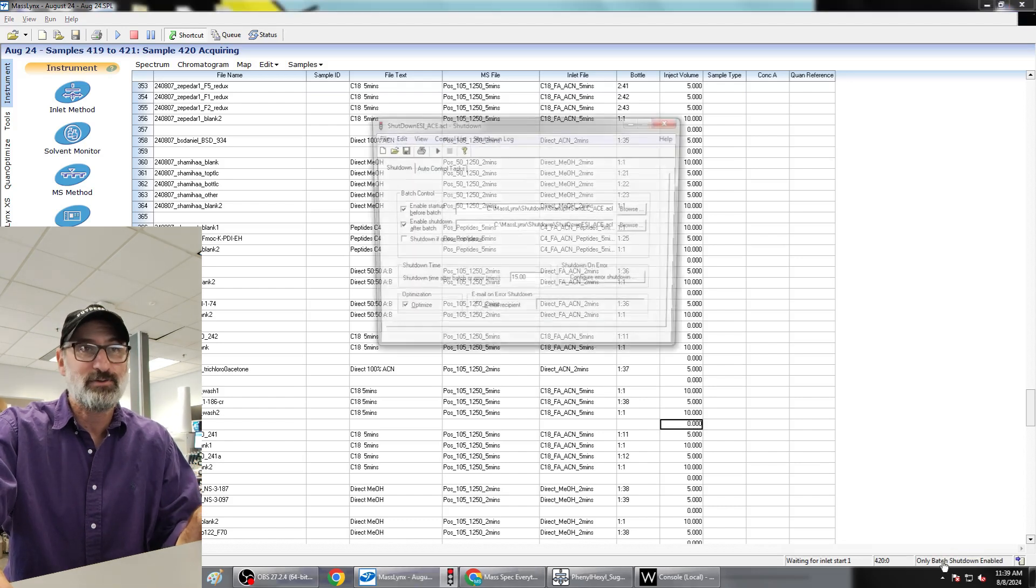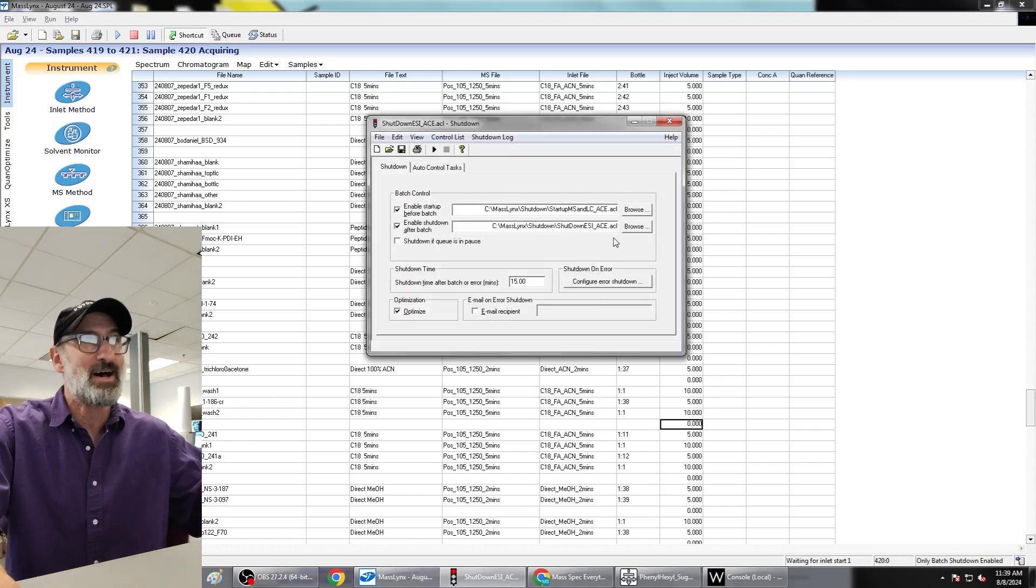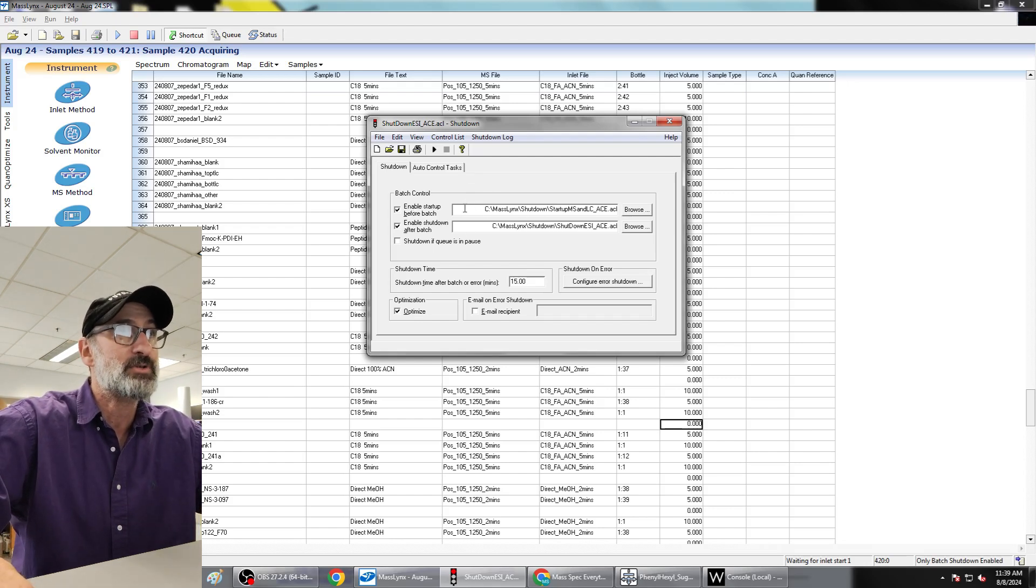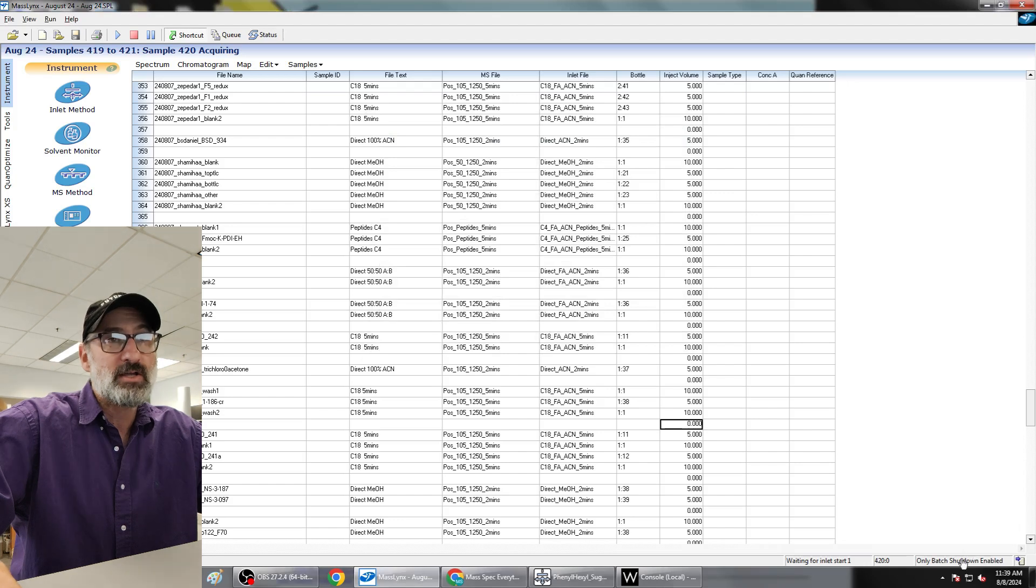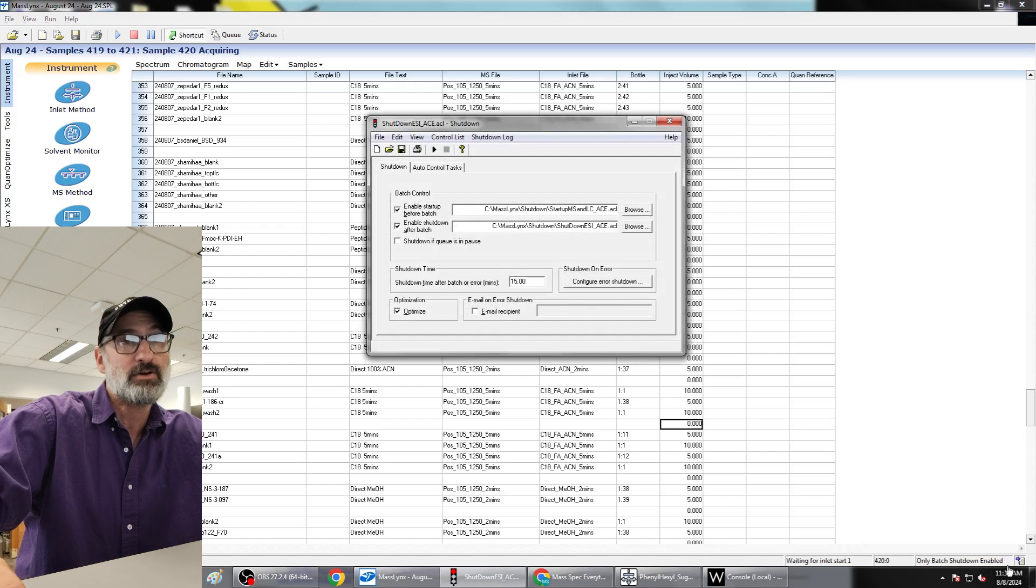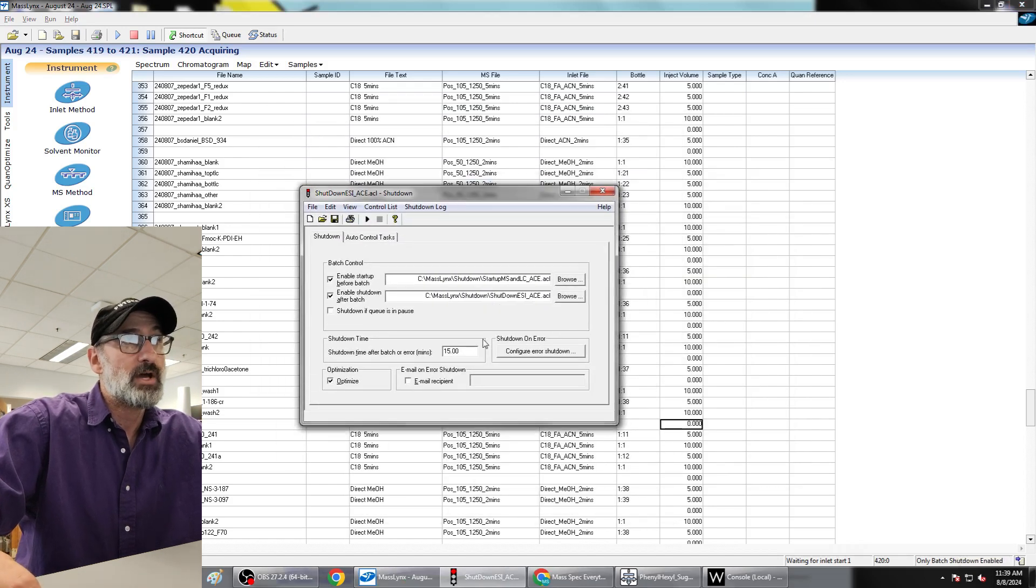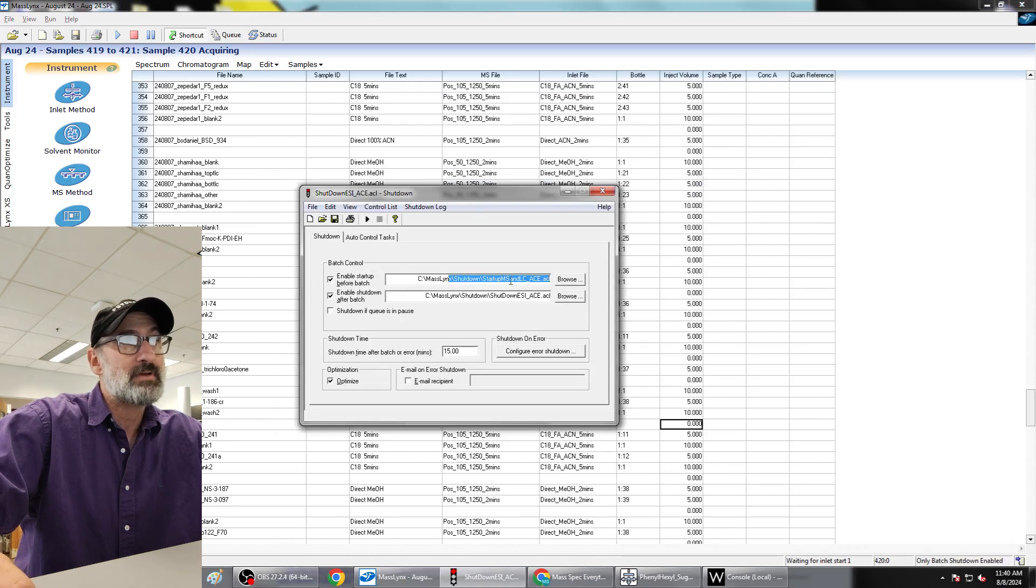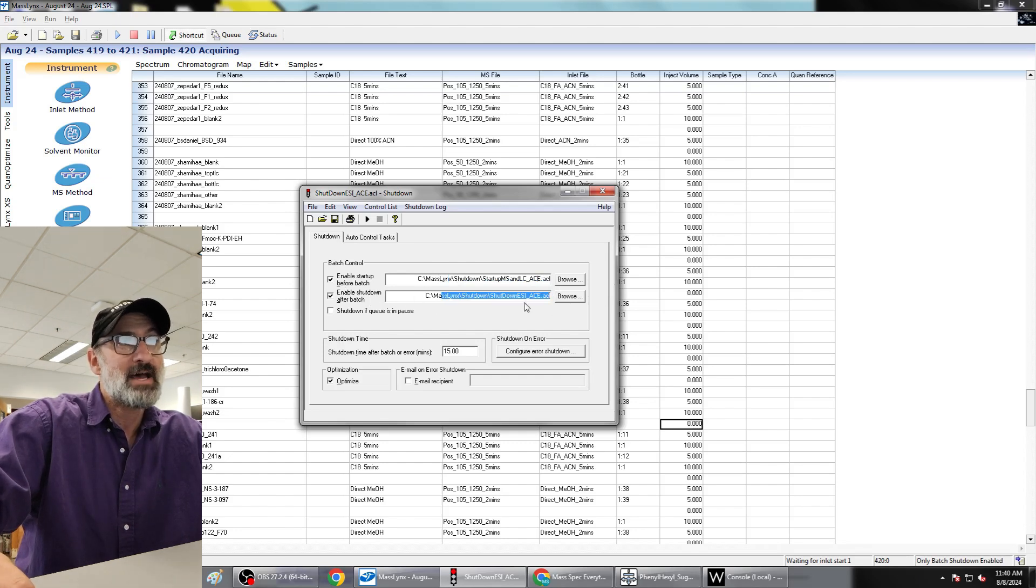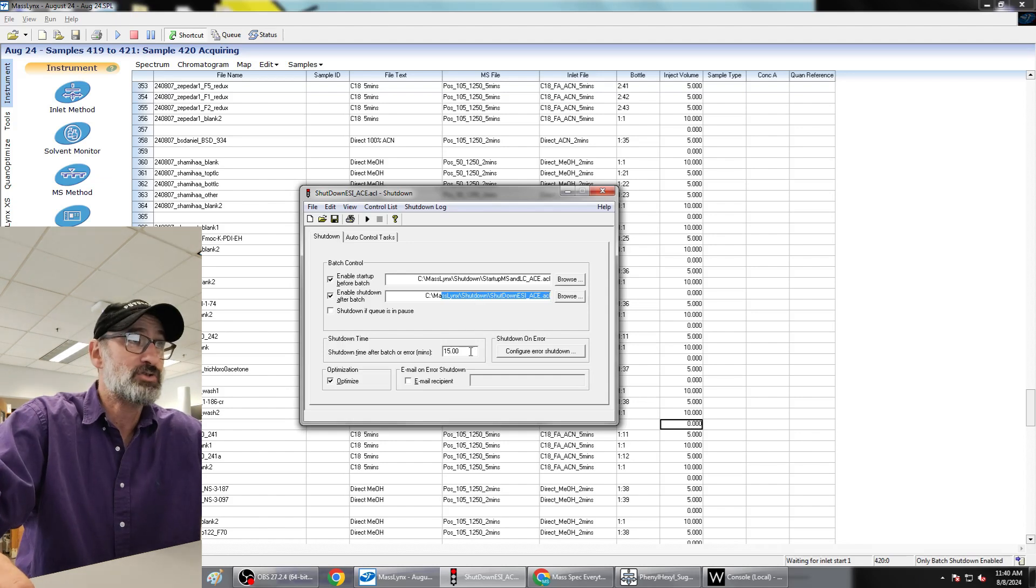So I actually had to get on the phone with Waters Engineers and set up how to do these batch startup shutdowns. In the bottom right corner here, you can see I'm clicking on the only batch shutdown enabled button-ish thing there, and that opens up this configuration window. So right now I tell it to use the startup LC-MS ACE program when it starts the instrument, and then use the shutdown ESI ACE program when it shuts down the instrument.